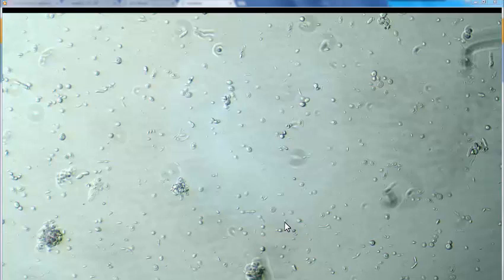And here's the low microscope, or low magnification view, 200 times, showing us a reasonable range of organisms.